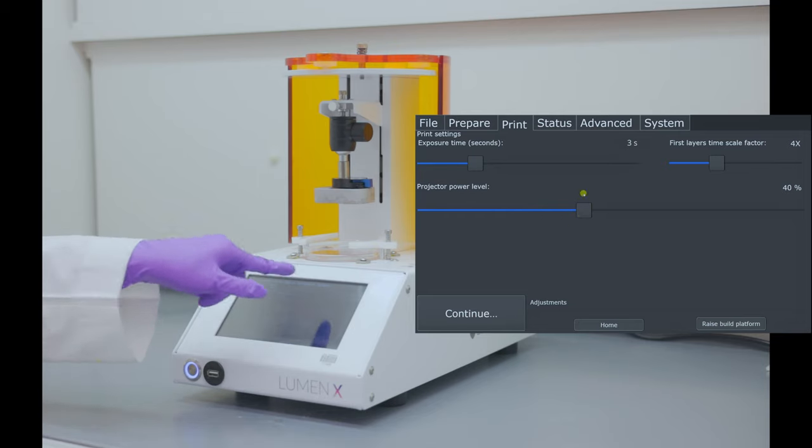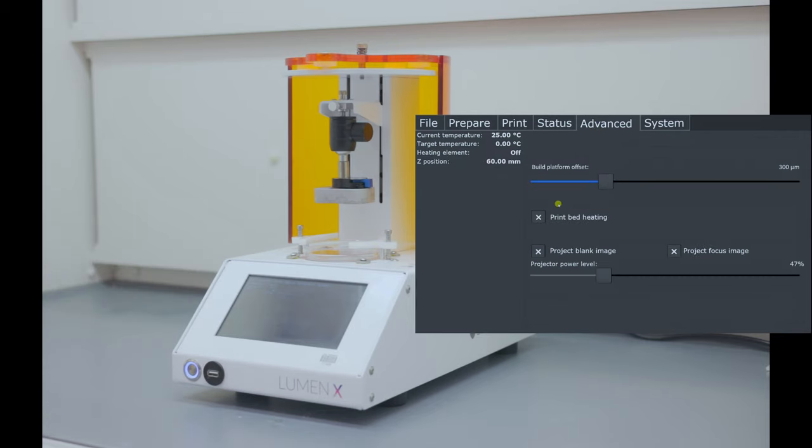Before tapping on continue, go to advanced menu. Here, you can enable print bed heating and adjust the build platform if needed. Now, go back to print menu and tap on continue.